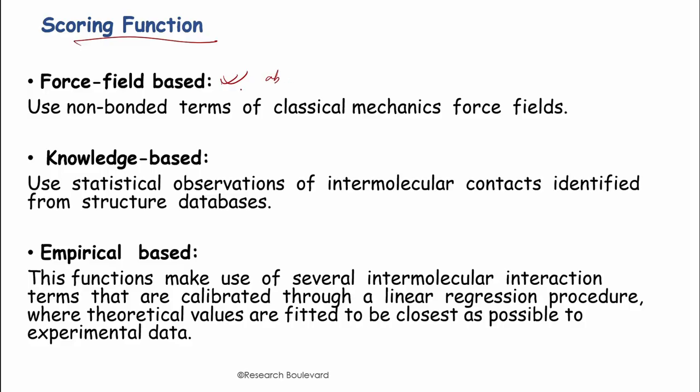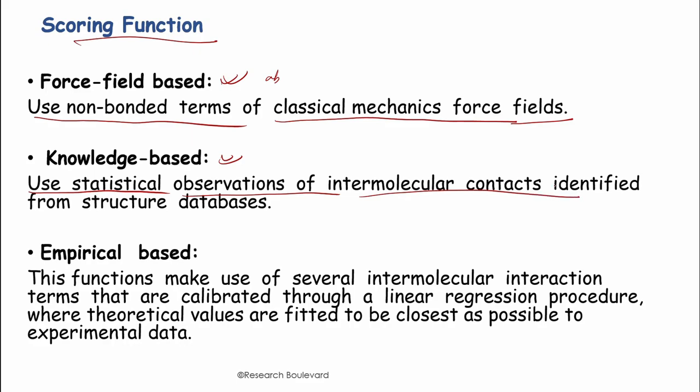These structured databases are the experimental structured databases, so they include some kind of experimental data for getting this statistical potential.